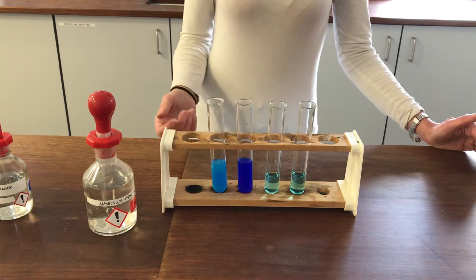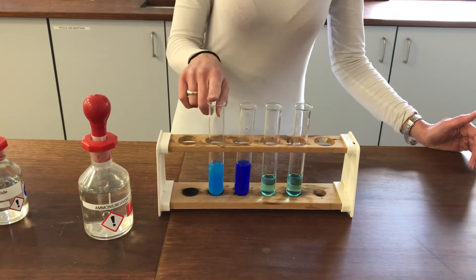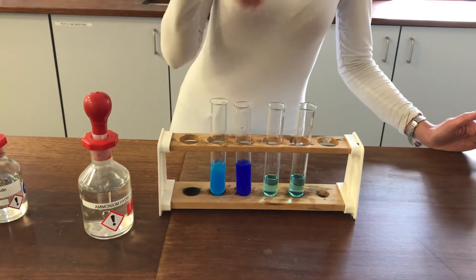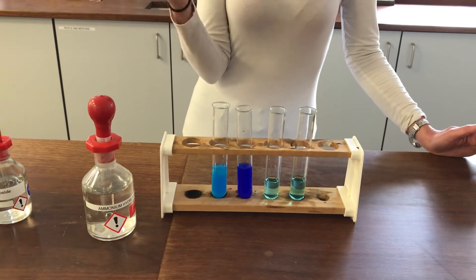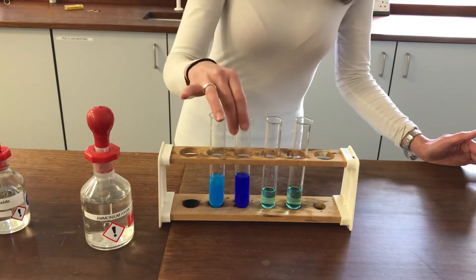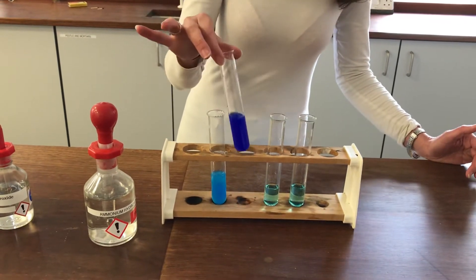What's happened is that the ammonia in the ammonium hydroxide — because ammonium hydroxide solution is really an equilibrium mixture of ammonia gas, water, and ammonium hydroxide ions — the ammonia is acting as a ligand and displacing the original water ligands. So I've now got what's called a ligand exchange reaction. Initially it formed the copper hydroxide, the same as the other tube, but then it went on to do a ligand exchange reaction, and usually it's four ammonia ligands that cluster around the copper, reinstating a complex with a 2+ charge which is why it becomes soluble again.